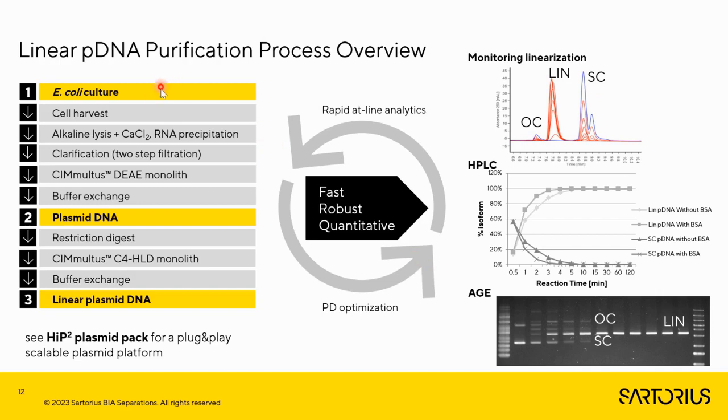So I walked you very quickly through the steps, didn't touch upon the culture, but did mention the harvest, alkaline lysis, clarification, and then the capture step on the DEAE monolith.